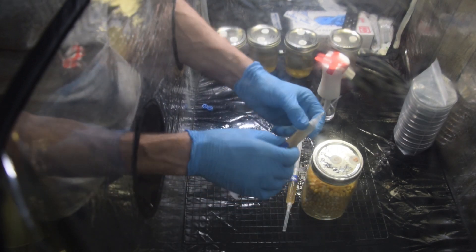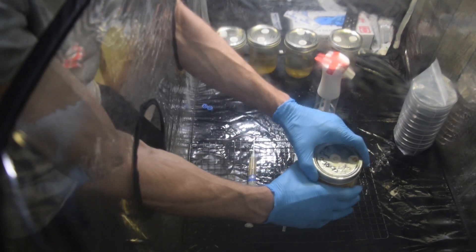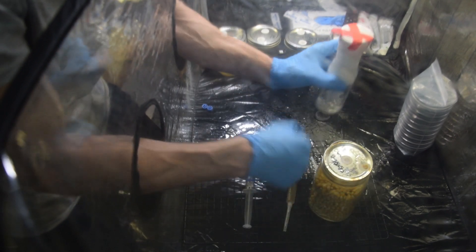So I have my needle on here in the syringe. If you've watched my other mycology videos, you know that I'm a little overzealous with my rubbing alcohol. With the still air box, as long as you keep spraying it with some alcohol and letting it sit, it's going to kill most of the germs that are in here.